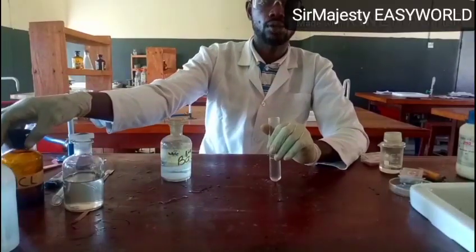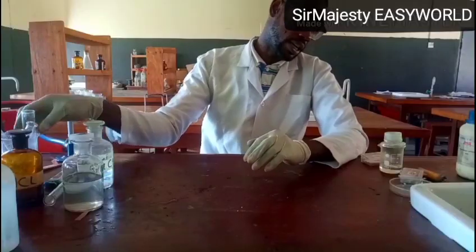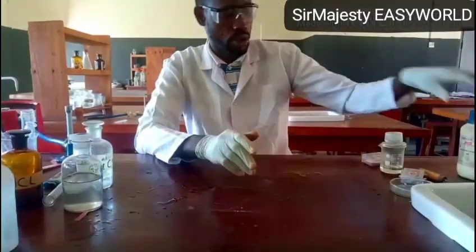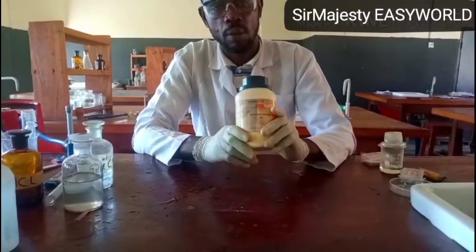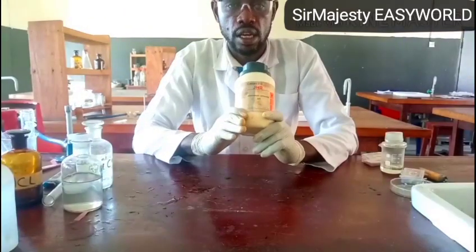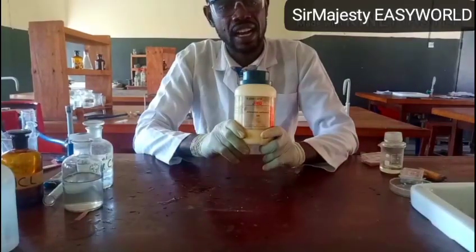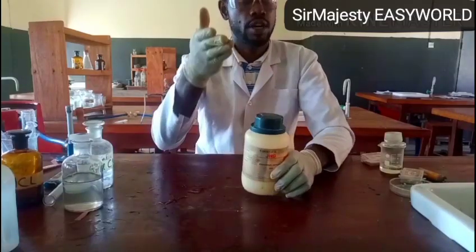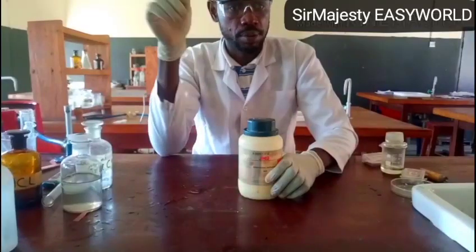Remember, in this video I just taught you how to analyze ammonium carbonate. But don't tell the examiner that sample C or sample D, whatever they call it, is ammonium carbonate when you are not told to identify the compound. And I told you that it is the ammonium salt that liberates ammonia gas even without treating with sodium hydroxide. All other ammonium salts, if you treat them with alkalis such as potassium hydroxide, sodium hydroxide, even calcium hydroxide, will liberate what? Ammonia.